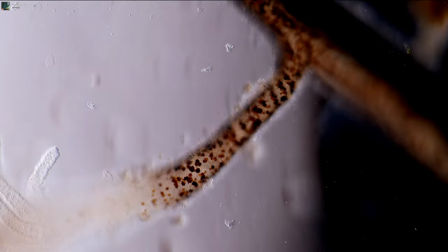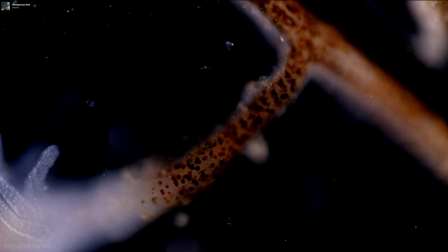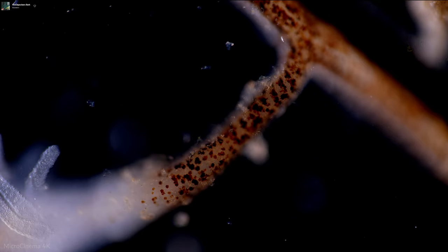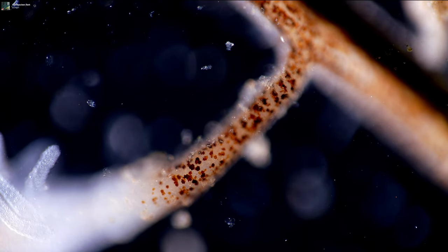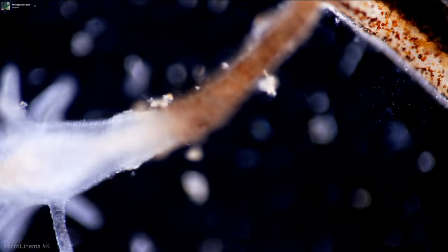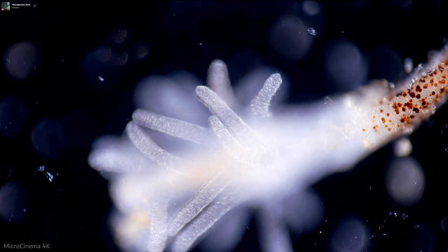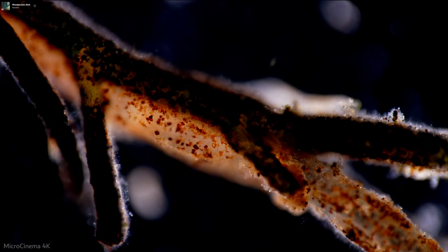You know what? Let's pop in. Let's get Darkfield going on this. This might actually be destructive. And just right there is fine. And yeah, wow. There we go. Yeah, look at this thing. These little tubes.